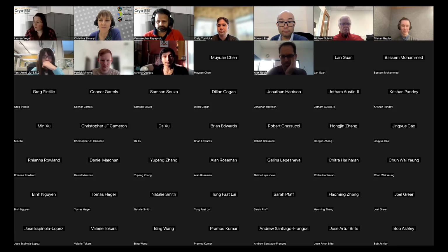Do you want to get to some of the questions in the chat from our participants that are in the meeting? We do have a question. Is there a version of Topaz available for particle picking in tomography?